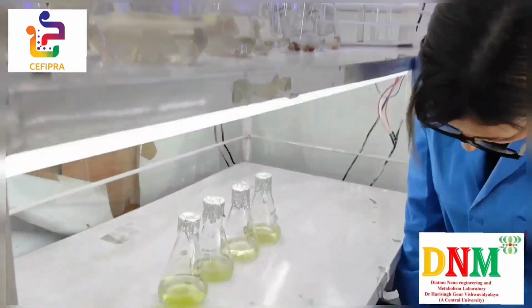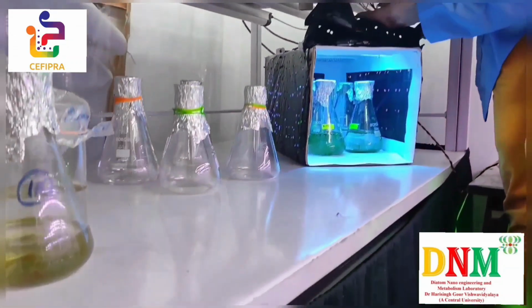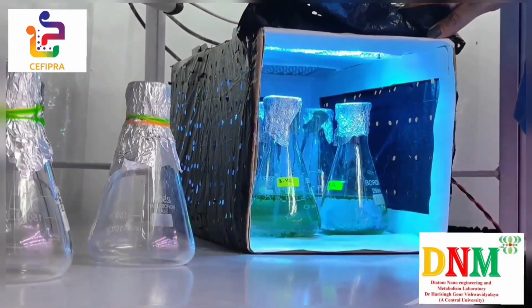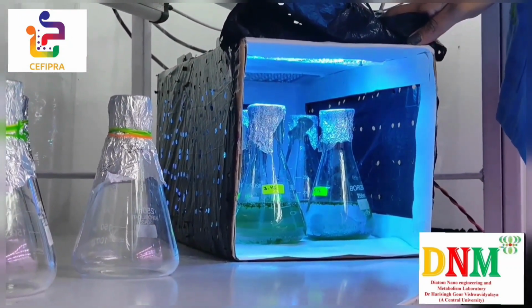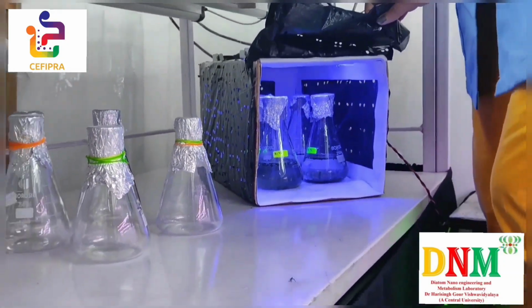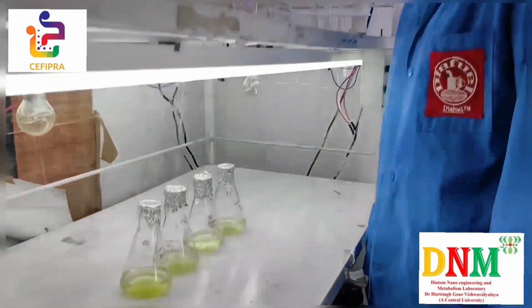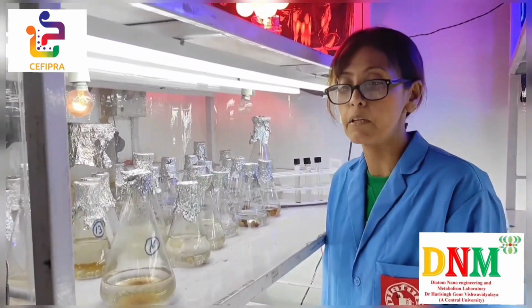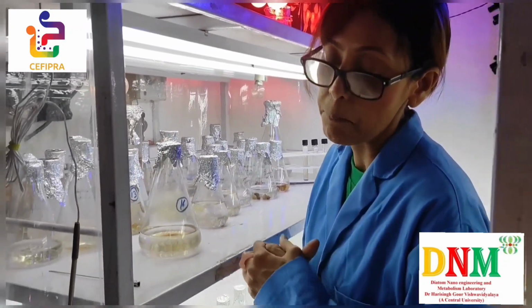A combination of flashlights. So this is a small experiment which is going on, in which there is a blinking on and off of the blue and the red lights in this particular setup, and this is really interesting, as we are getting very good results regarding both their biomass increase as well as their pigments. And not only this, we are also making some commercial products of great use.